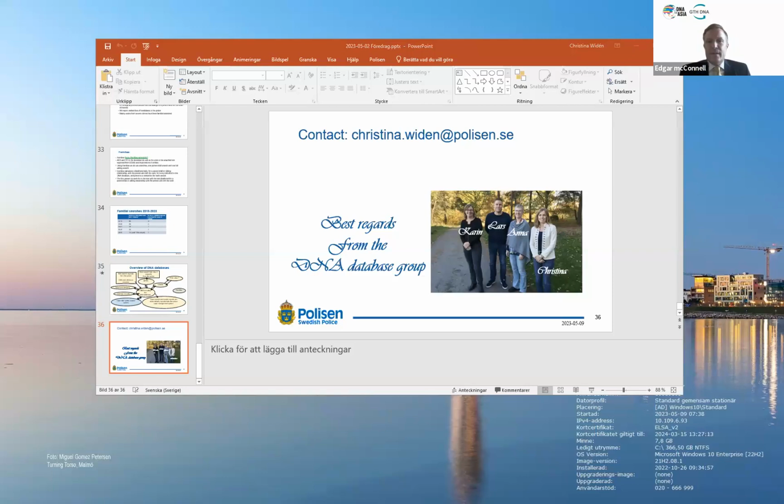Okay, thank you. And then the final question is from Muji Novrita. Is there any platform in DNA database software to exchange information about DNA regionally? If we have any information about the region of the state, was that the question? The question is, is there any platform in DNA database software to exchange information about DNA regionally? And I'm guessing it's CODIS that you use. Yeah, it's CODIS, and between the regions in Sweden, all the police regions send in their DNA items to us. So we have managed the national DNA database for all 7 police regions. There's only one database. That is managed by NFC and me and my 2 colleagues.